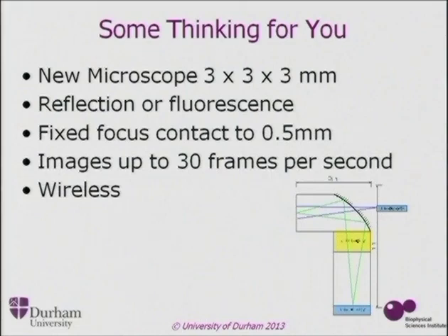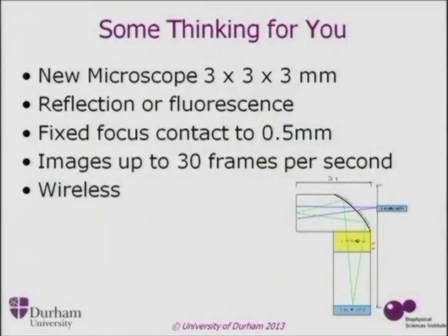You can do this using diamond turning, so it's possible to machine optical quality, and you can actually make these surfaces any shape you like, which is an important thing here. So it's not molded, it's been specifically machined with very high precision. The way it was shown here has an optical fiber, but we've actually got one where we literally put a miniature LED directly on the back of it.